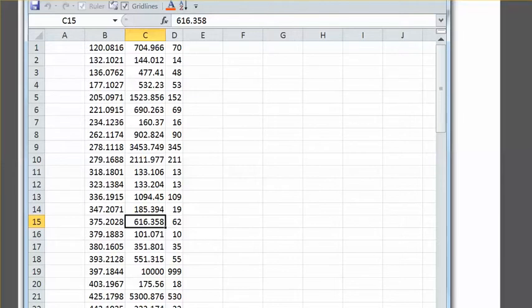Now in this spreadsheet, I've copied in the experimental values from massbank.jp, and this spectrum is CO000247. Now I'd like to compare these values to the theoretical values to try to get some idea of where to set the mass error window for this data set.